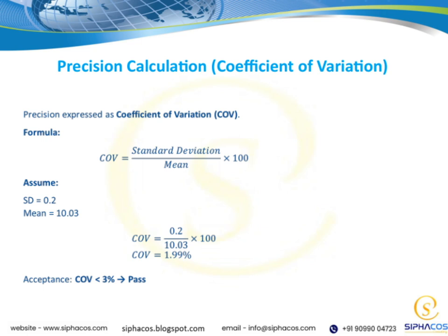Highlighting this point is important because, in our overall analysis, having a clear grasp of variability helps us assess the reliability and precision of our measurements. It's especially valuable when comparing data that are on different scales or units. So, mastering the coefficient of variation allows us to make more informed decisions, improve accuracy, and enhance the overall quality of our data analysis.